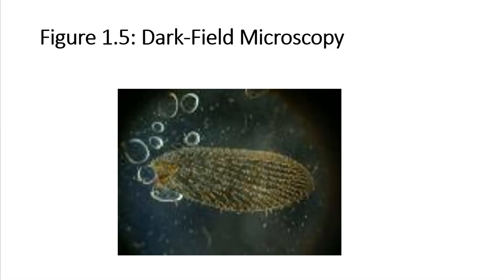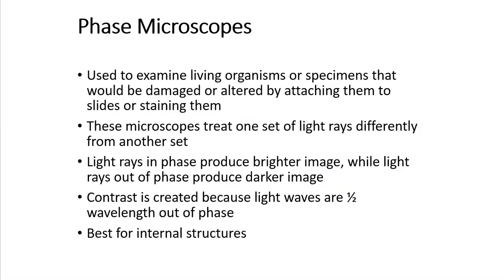This is dark field. This is what it looks like. And you can see, you don't really see a lot of features on this image. Can you see the edges and stuff like that? And that's what we really use dark field for. All right, phase is interesting. We can look at this.